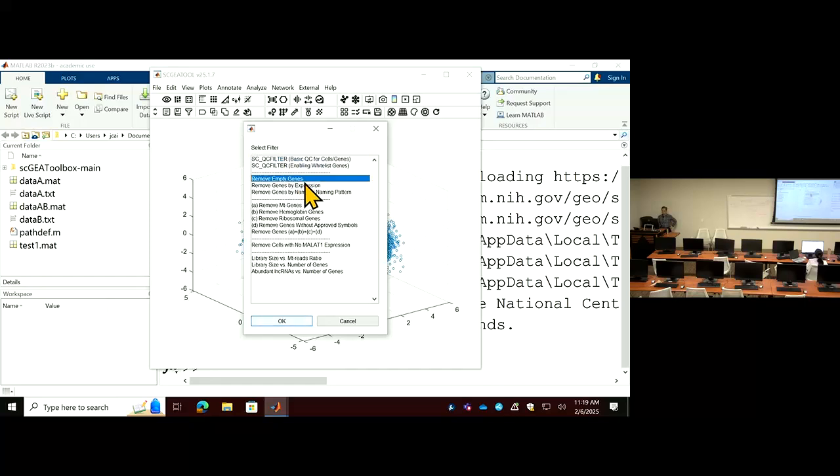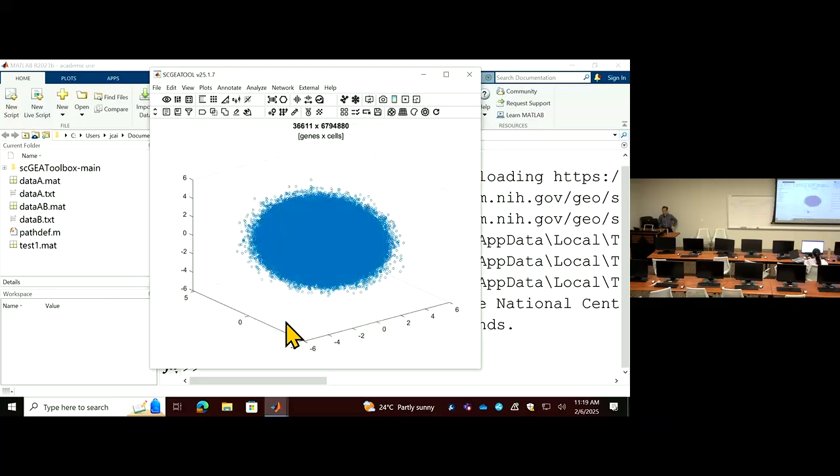So I will first remove the empty genes. Empty genes means that across so many cells, some rows, some of the genes, are all zero. If you have a case like this, this gene definitely should be removed first, right? We don't need them. There's no information, unless you believe sample 2 has this highly expressed. But just for this purpose, we just remove empty genes.